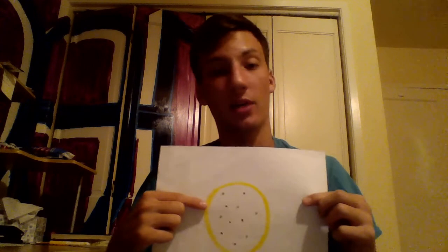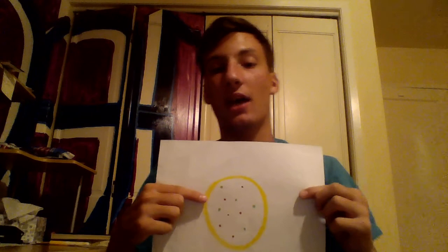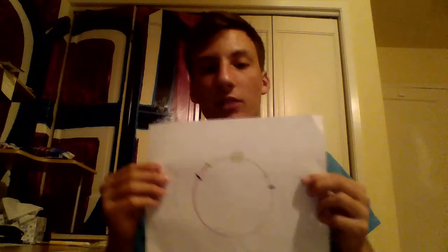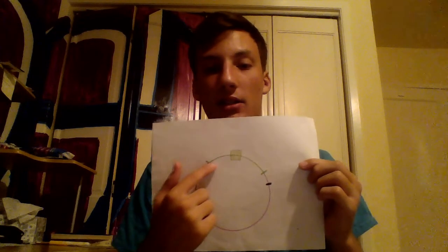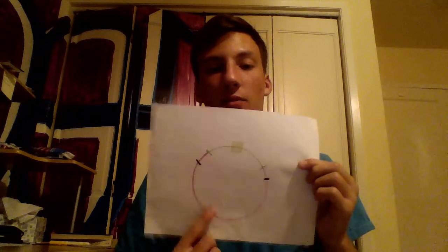And that is because the agar plate has an antibiotic on it. Now, the reason why the green dots are able to stay alive is because they have the resistance to the antibiotic. And I'll show that to you right now. So essentially, this is what the green dot would look like at the cellular level. So you see, it has this insert, and it has this. We can use this square to represent the resistance to the antibiotic.